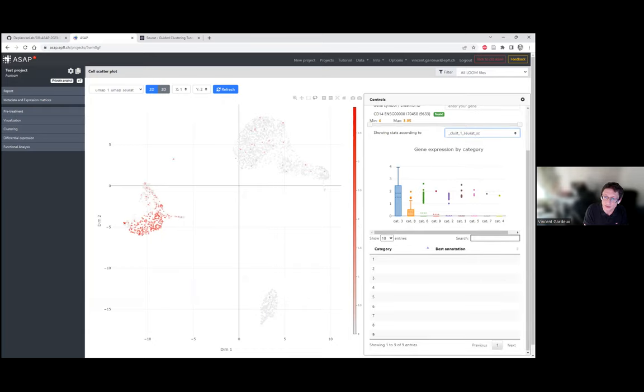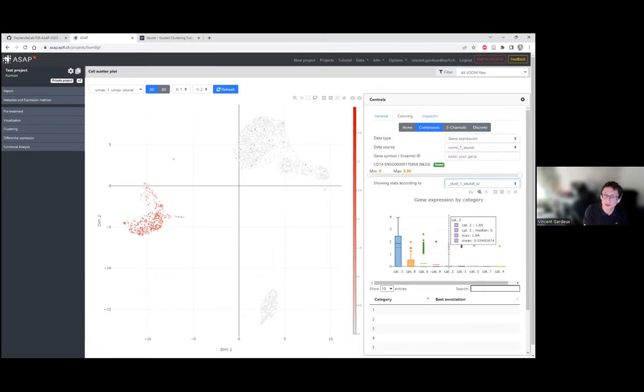And if you have some annotations that I will show you afterwards, then you also have a recap here. So that's a way, when you are in this view of gene expression, to display not only the gene expression, but also some information relative to a clustering, to an important metadata, and also if it's linked to any informative annotations. Okay.